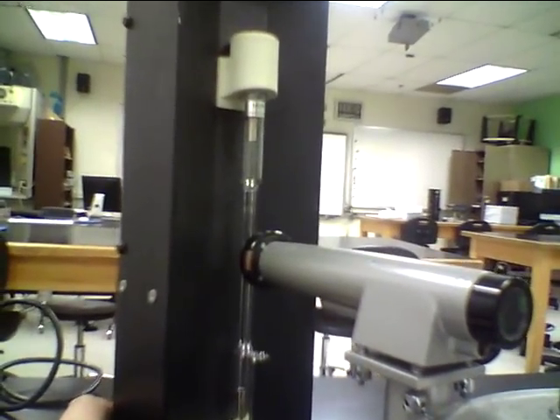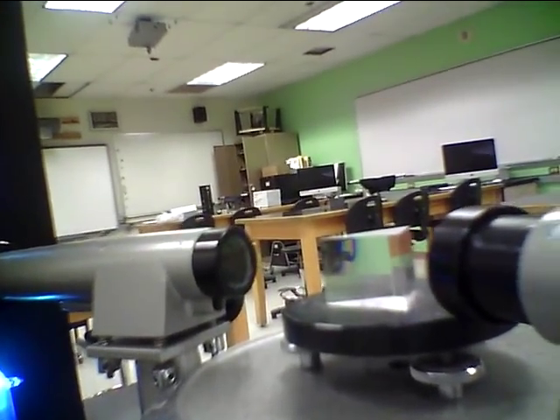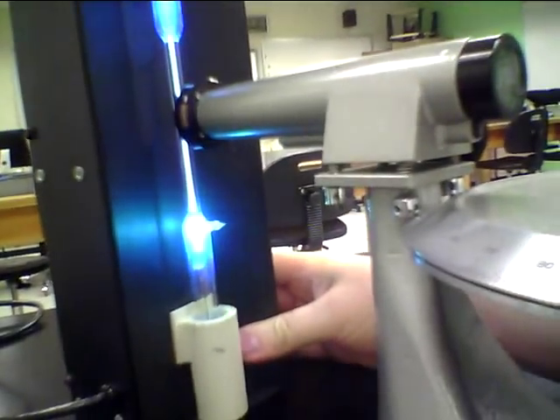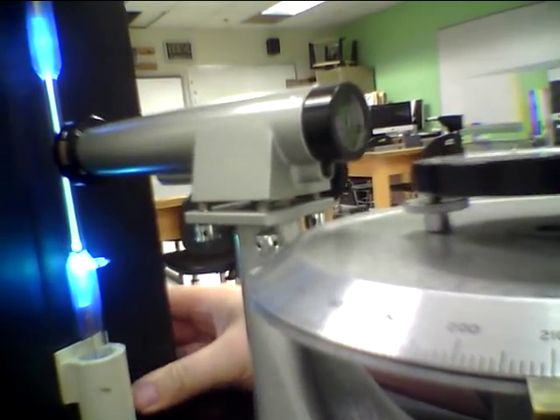Now we're ready to put the light source right in front of the collimator, right in front of the slit. I put it just a couple millimeters from the slit — it's almost touching. Let me turn it on. Then I'm going to move the light source back and forth side to side with my hand while looking through the scope until the lines are as bright as possible.